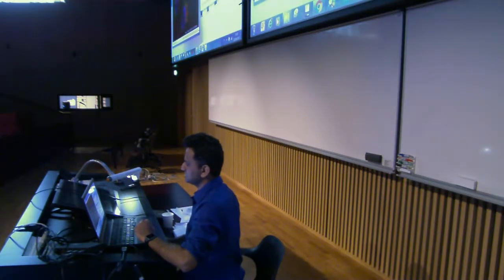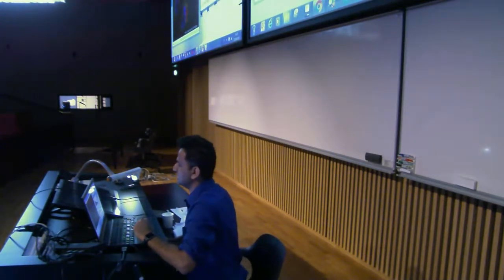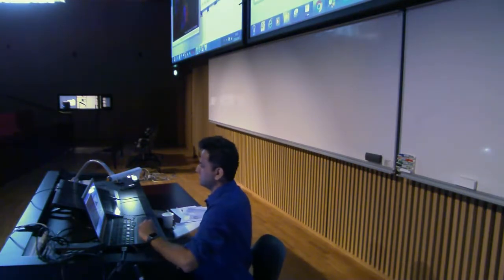Because this is a color slider. Okay, and always look at the histogram in log mode, because you remember you might have acquired this data with a 12-bit camera, and that's why you see the maximum intensity range 4096. Okay, but as I said, the computer can only understand 8-bit and 16-bit, so that's why you see a 12-bit image put into FIJI as a 16-bit image. But still the histogram will only go up to 4095.